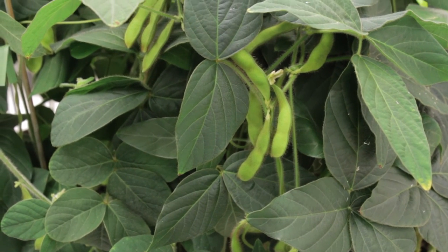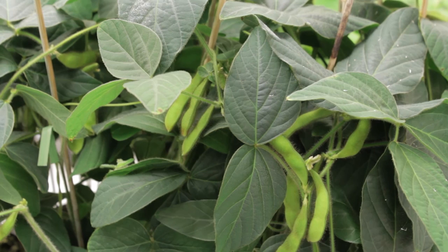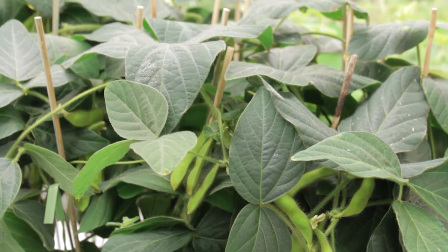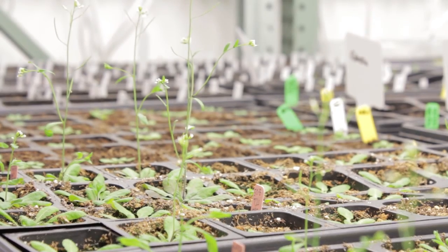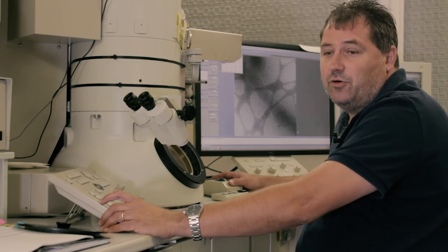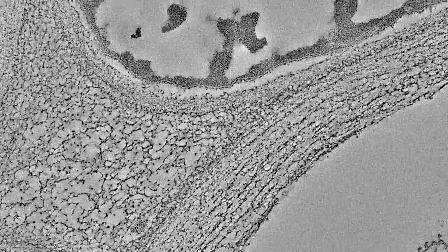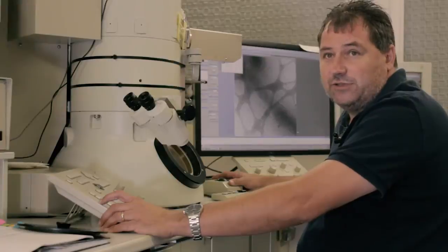Most biological processes happen at a level that you can't see with the naked eye, so you need a microscope to look at those processes. When we look at the nanoscale, electron microscopy is your method of choice. For example, if you want to know how plant cell walls are organized, we need to use an electron microscope. Or if we want to know how microbes efficiently degrade lignocellulose, then we need to use electron microscopes.